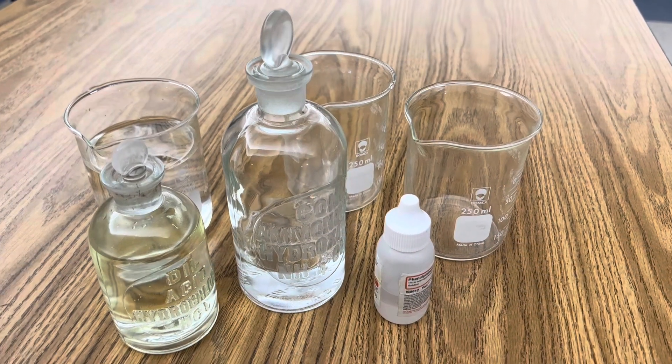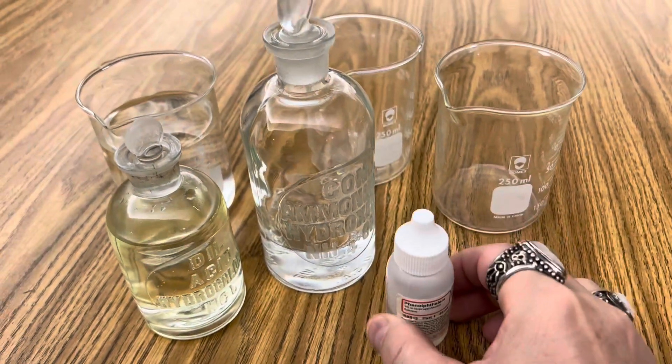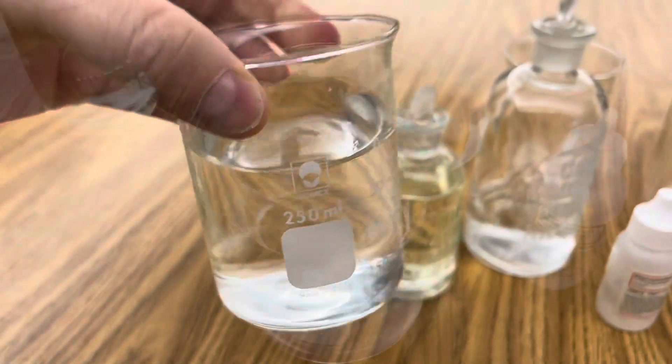All I'm using in this reaction is some hydrochloric acid, some ammonium hydroxide, phenolphthalein as an indicator, two beakers that are empty, and one beaker filled with 200 milliliters of distilled water.